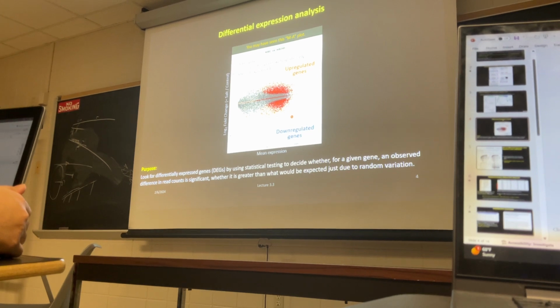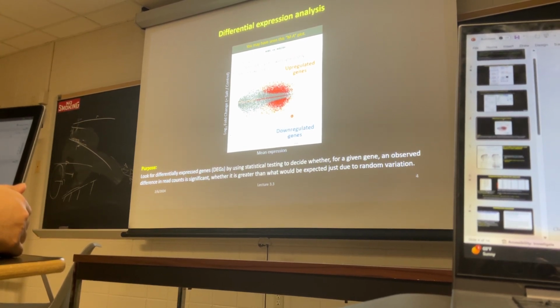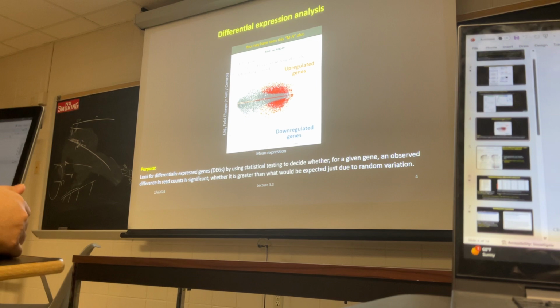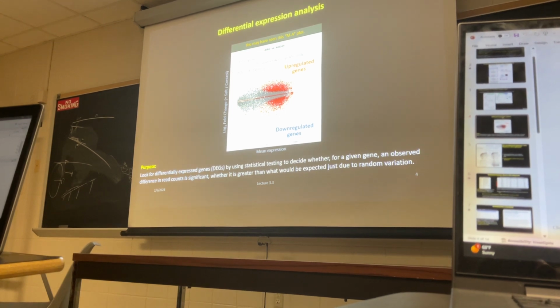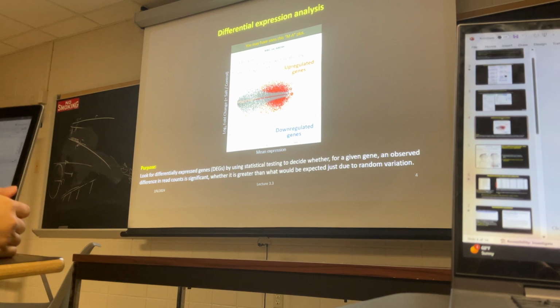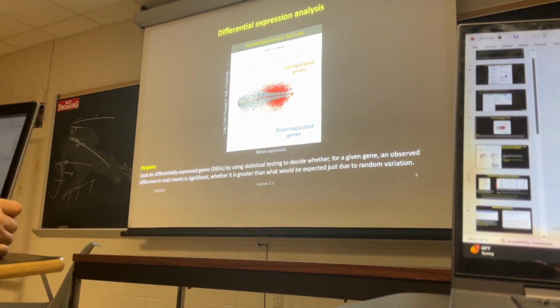But most of the time, your RNA-seq data set, when you design the experiment, you won't just have one-to-one. You will have multiple different either time points or different samples or different developmental stages, right? So you will have to have a lot of pairwise comparisons. If not, you are doing clustering. If there are like 100 samples of RNA-seq from like 13, 14 different developmental stages, then it's too much to do this type of differential gene expression analysis.